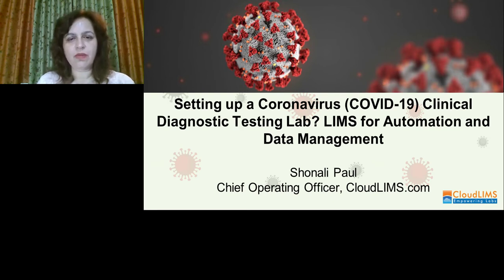Today, we are going to talk about the need for rapid testing of COVID-19 or the novel coronavirus infectious disease, the importance in containing the pandemic, the challenges in testing the SARS-CoV-2 or the virus that causes COVID-19, and in the end, how a lab manager can overcome these challenges by using a LIMS and thereby increase the response to the need for testing samples as new cases emerge.